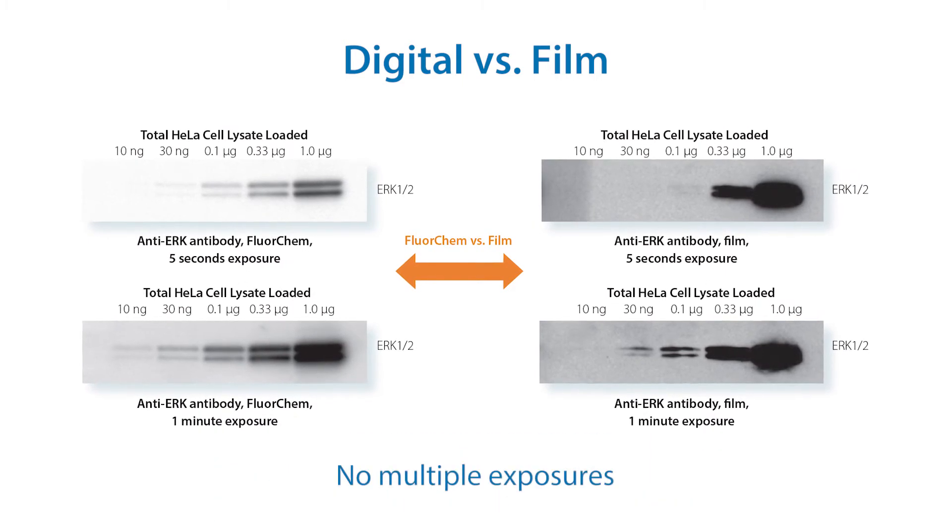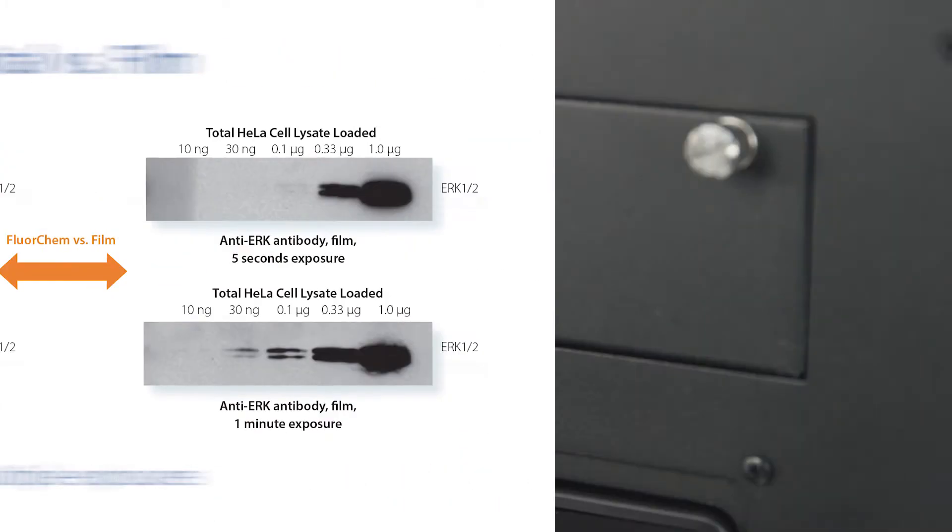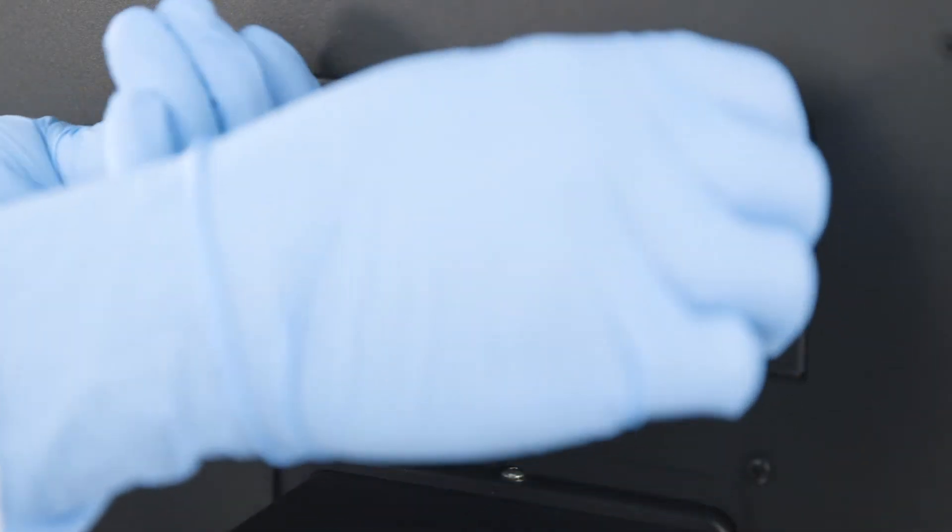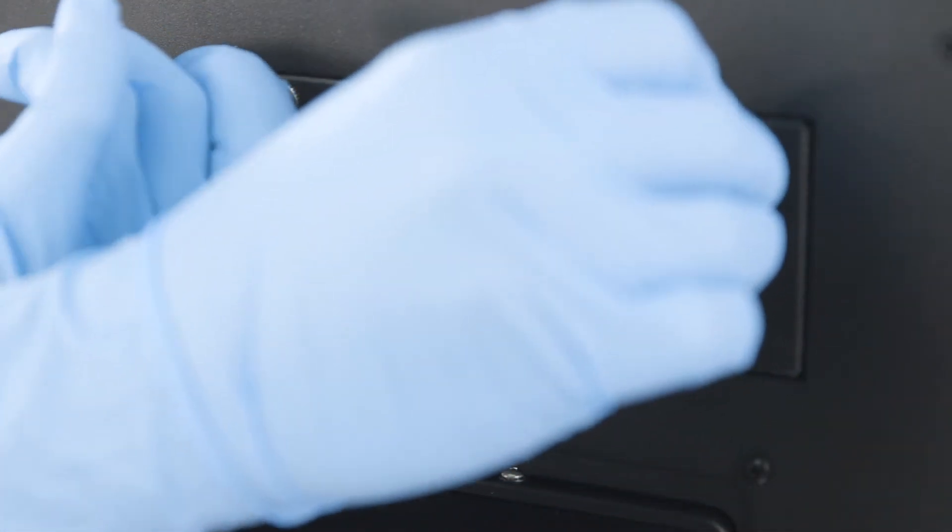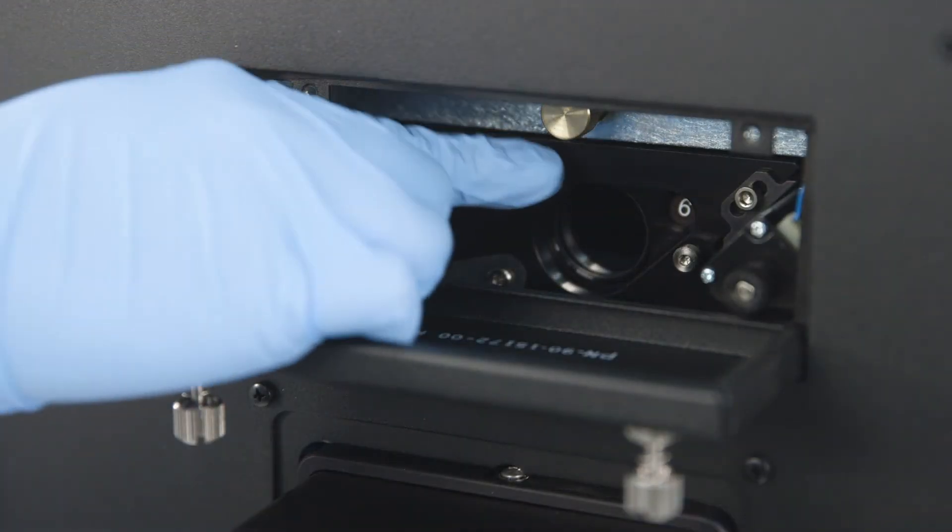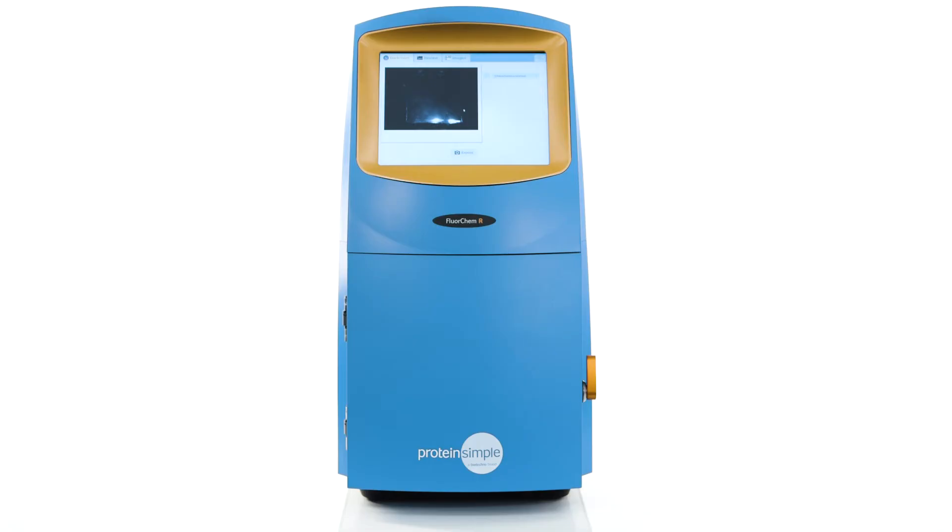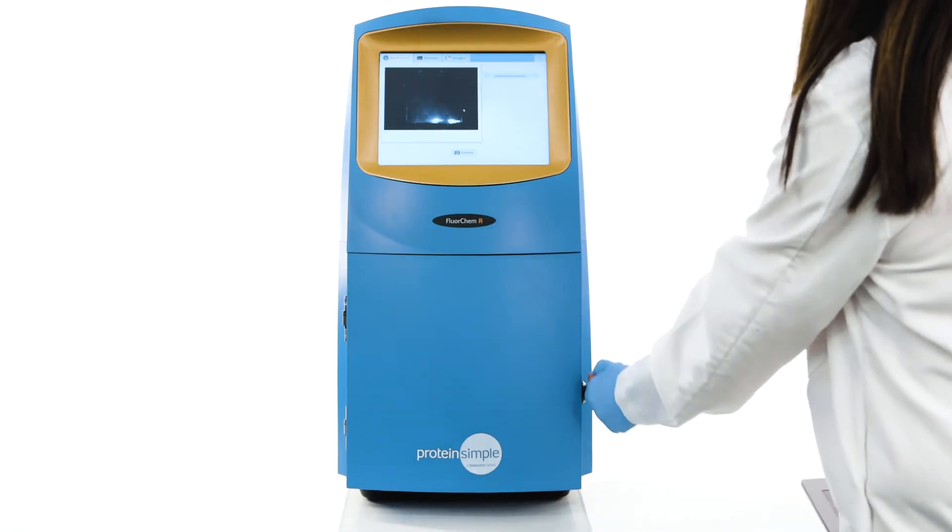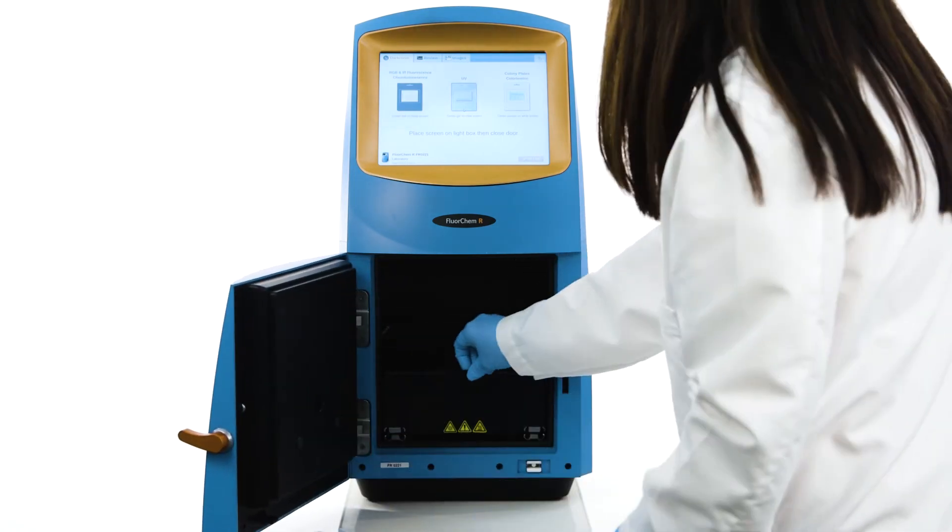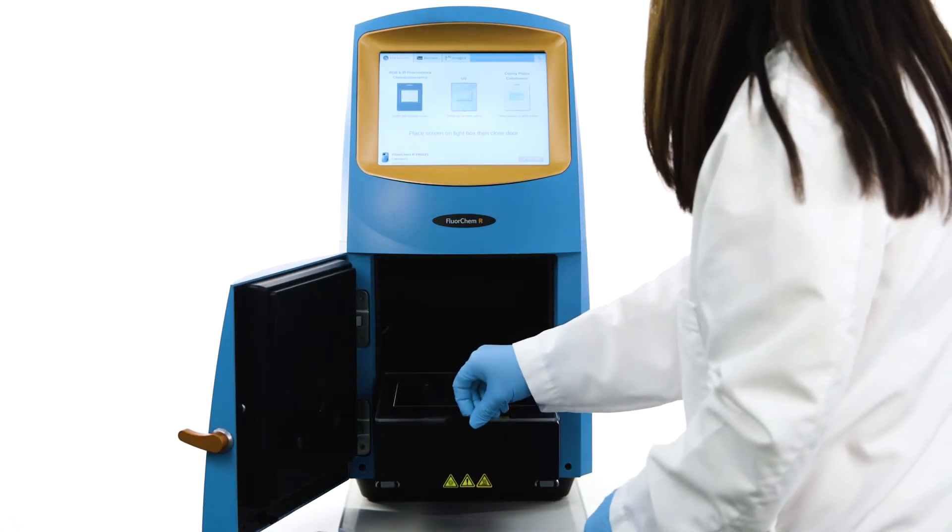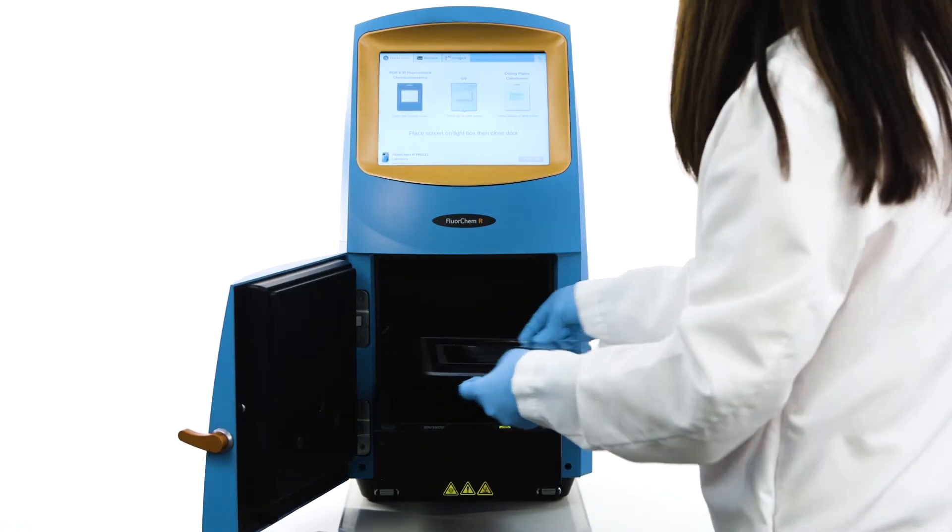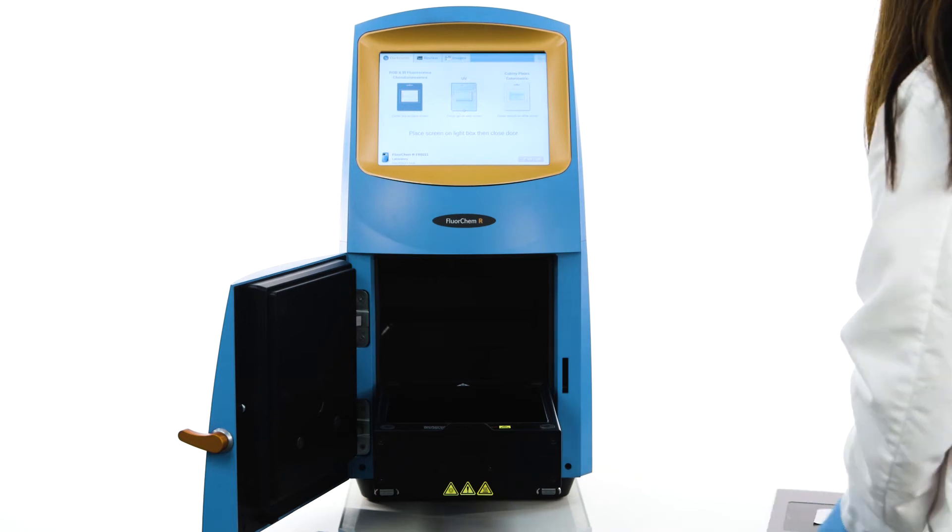The M and R models offer access on the back of the instrument to the emission filter wheel to add or change filters. Inside the FluorChem Imager is a pull-out UV transilluminator, available in either a 302 or 365 nanometer wavelength.